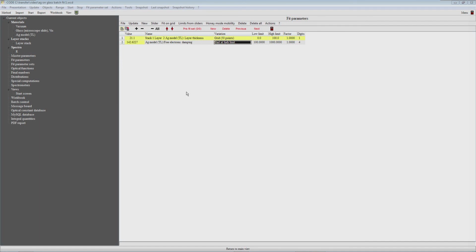And I would like to go back with F5 to the setting start at interval center, and in this case the code will start with the value 550, which is in the middle of 100 and 1000, and it will use this as a starting value for every fit, and then do the downhill simplex starting from there. So let's see what we get if we do that.